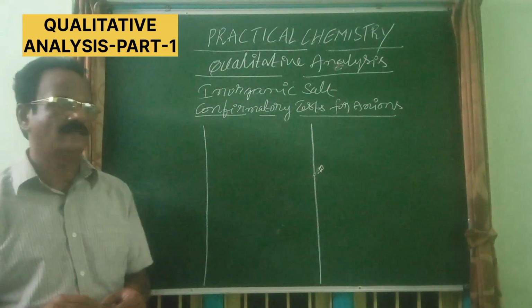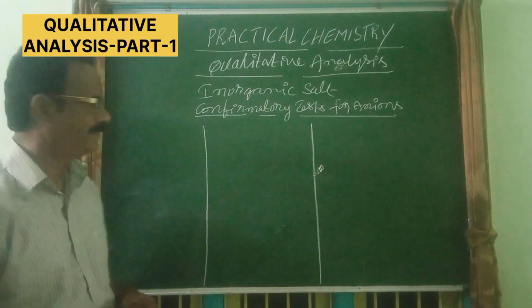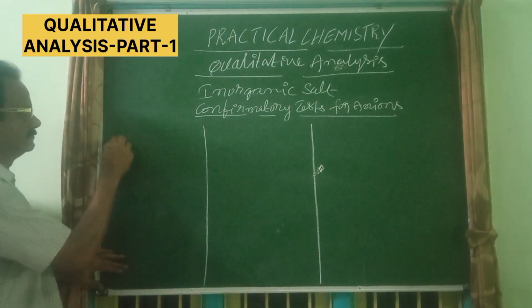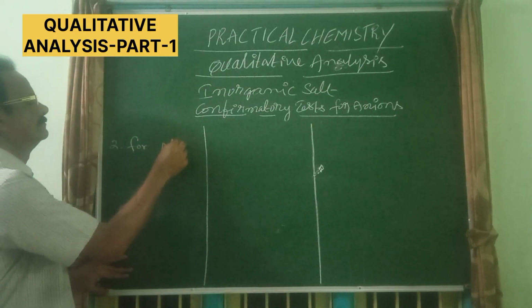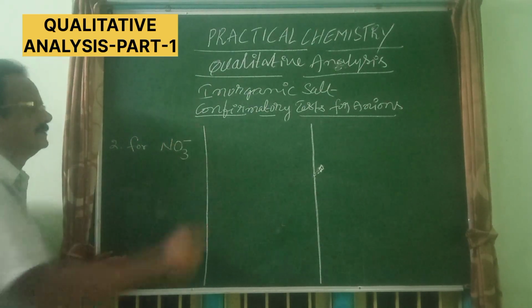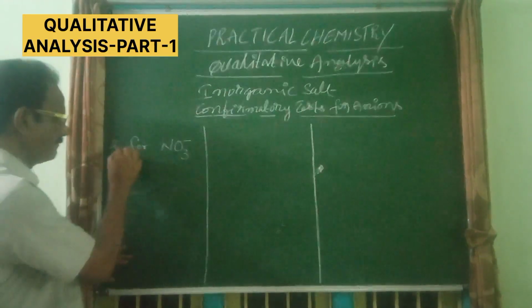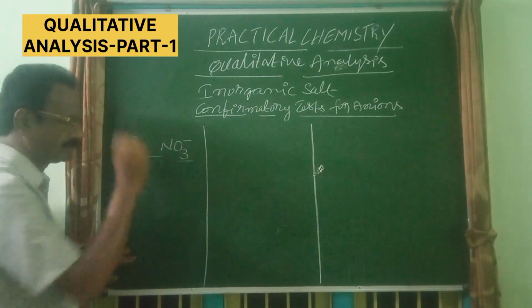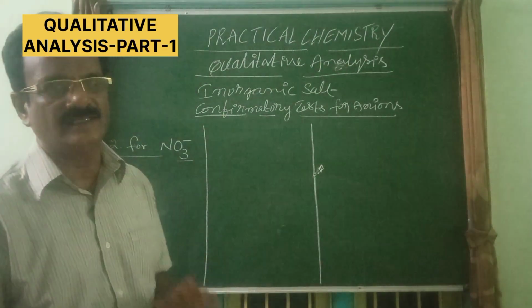Let us see the confirmatory test for nitrate. Here also the extract is to be taken in the test tube.